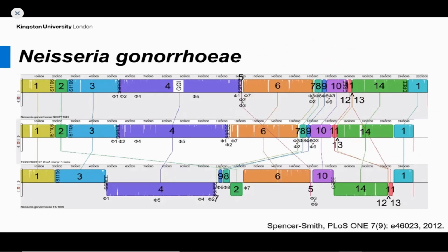So moving on, my group did some investigation of the Neisseria gonorrhea complete genome sequences. So at the time, there were 3 complete gonococcal genome sequences, and those are shown there in a Mauve whole genome alignment. So we've linearized the chromosomes and aligned them. And this Mauve program will find regions of similarity and give you blocks of color for those regions that are similar to one another. And you can see actually the beginning and the ends, those are similar to each other. They're not the same color, but we've numbered them. So you can see that region 1 and region 1 are both the beginning and the end of the chromosome.